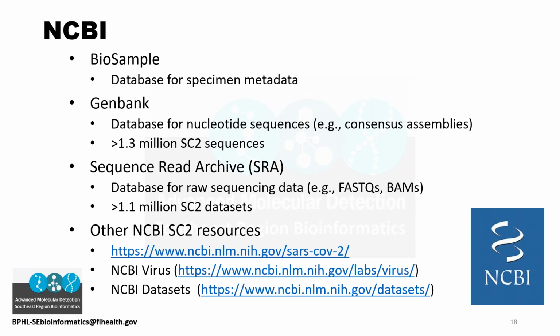There's too many to go over, but I'm going to focus on the ones that are relevant to what we're doing regarding SARS-CoV-2 data submissions and data usage. So the three different NCBI databases that we'll be submitting data to are BioSample, which is a database that strictly just collects your specimen metadata. It has no genetic data in that specific database, but it links your specimen metadata back to genetic data in other databases. GenBank, a database for nucleotide sequences.